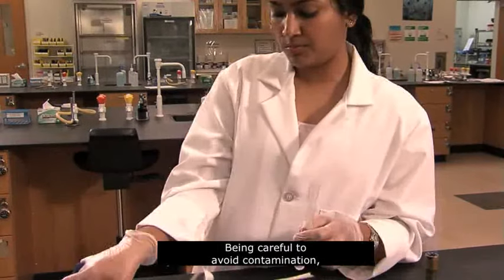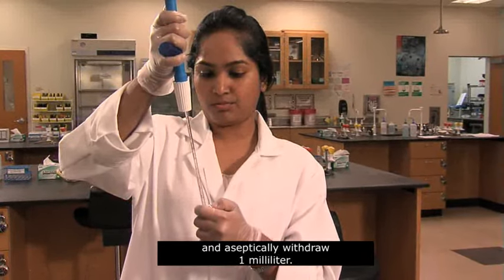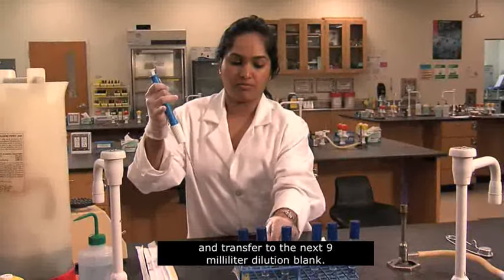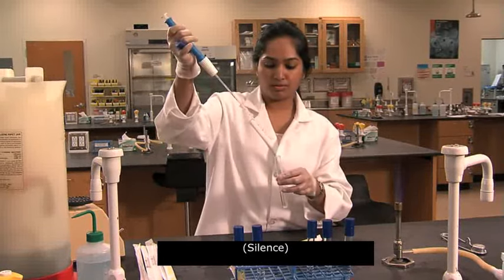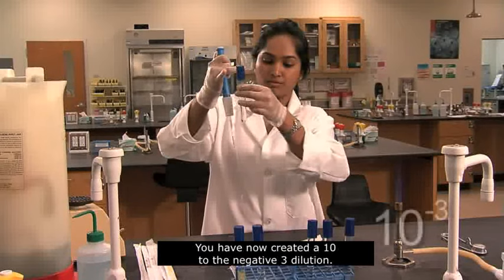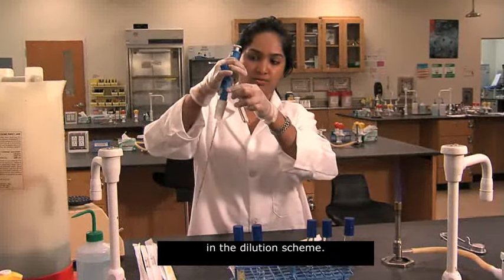Being careful to avoid contamination, insert a new pipette into the aspirator. Then pick up the 10 to the negative 2 dilution and aseptically withdraw 1 milliliter. Remove 1 milliliter from the 10 to the negative 2 dilution and transfer to the next 9 milliliter dilution blank. You have now created a 10 to the negative 3 dilution. Then make the remaining transfers in the dilution scheme.